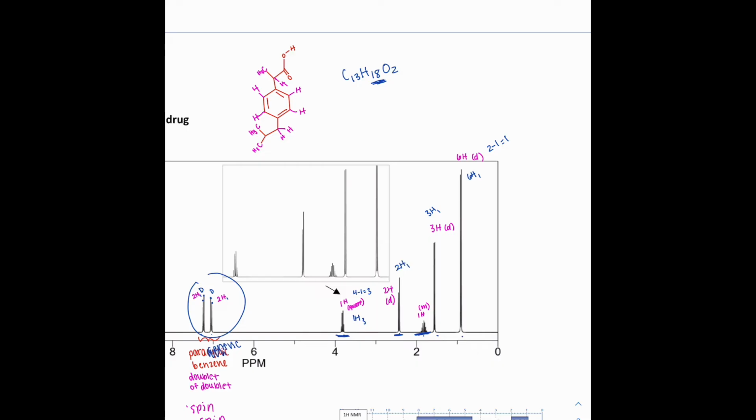but we are almost in that range of the carbonyl compounds. So we do have that, or I guess here I'll take a minute to look at it, so I can copy it over there as well. So if we see, following this, we do have that oxygen double bonded to that carbon, and then another carbon, and then that other hydrogen. So I think that does fit very well.